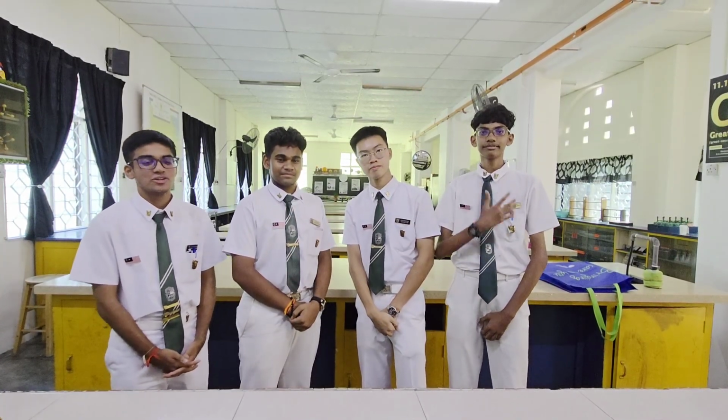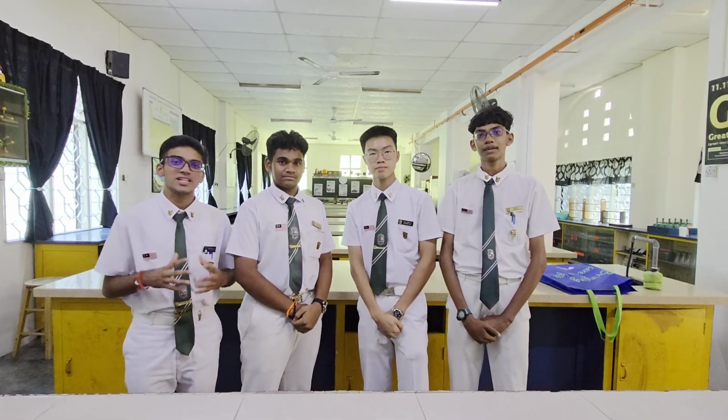My name is Daneshaaran. Today we will be conducting an experiment on how red cabbage solution can be used as a pH indicator. Let's go!